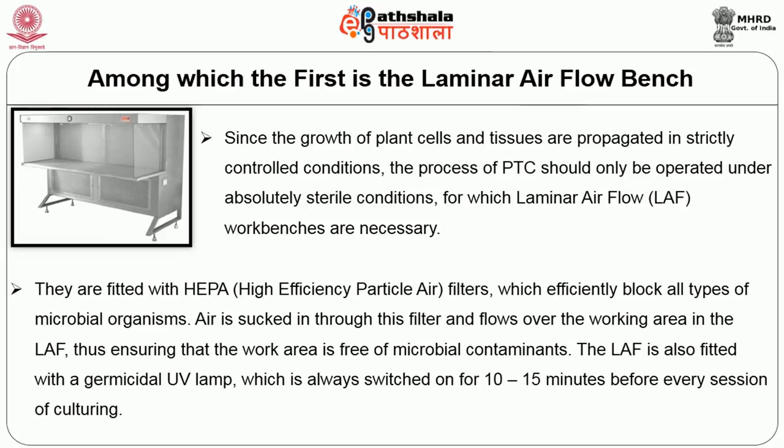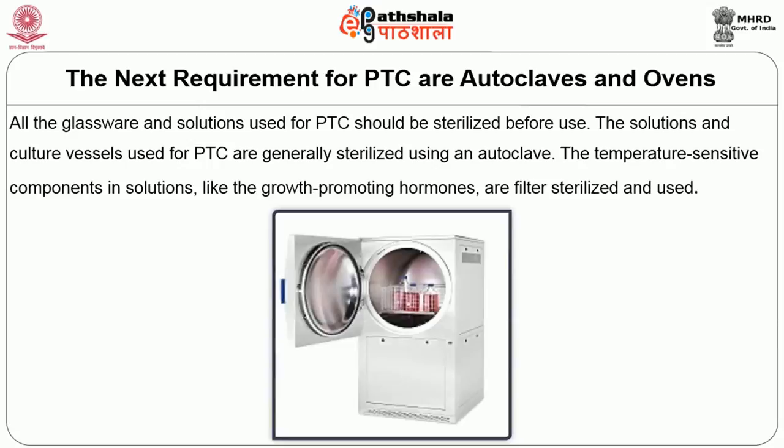The LAF is also fitted with a germicidal ultraviolet or UV lamp, which always is switched on for 10 to 15 minutes before every session of culturing. The next requirement for PTC are autoclaves and ovens. All the glassware and solutions used for PTC should be sterilized before use. The solutions and culture vessels used for PTC are generally sterilized using an autoclave. The temperature sensitive components in solutions like the growth promoting hormones are filter sterilized and used.